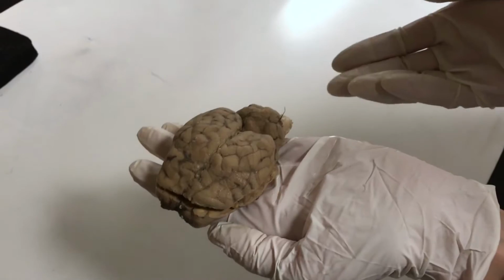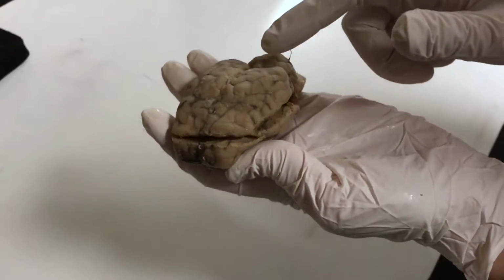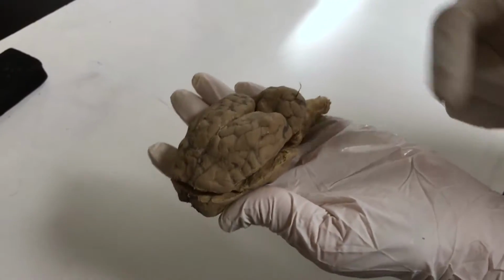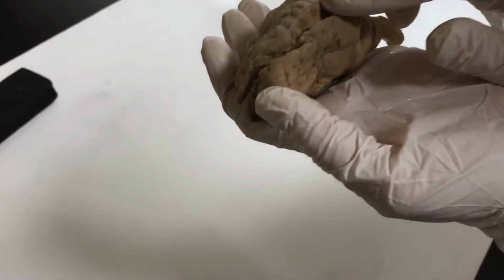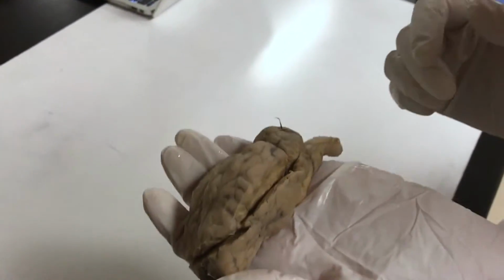So here you have a sheep's brain. Up here is the frontal lobes. Then the parietal lobe would be here and here. The occipital lobe is in the back here. And the temporal lobes are down near the bottom. And then somewhere in this region, which we cannot see, is the insula.